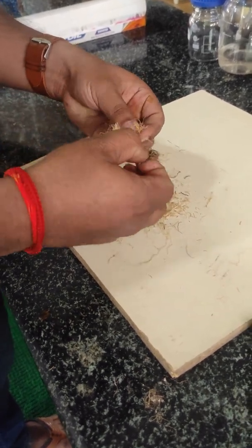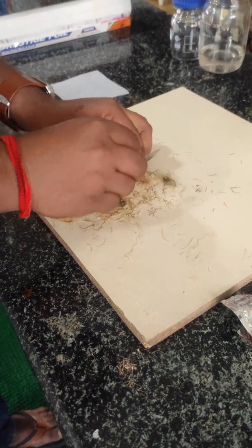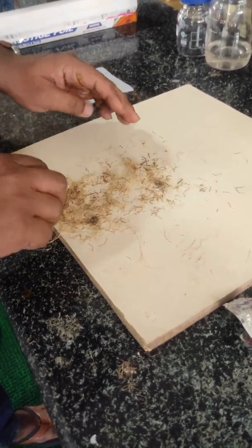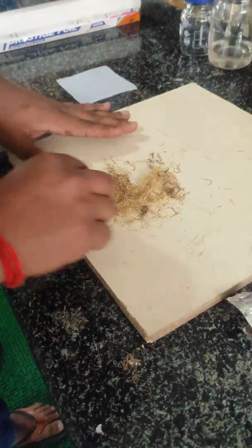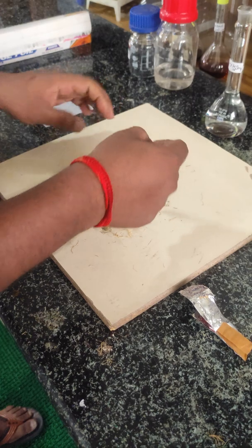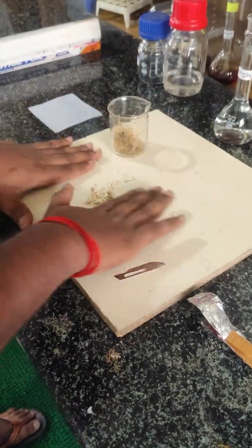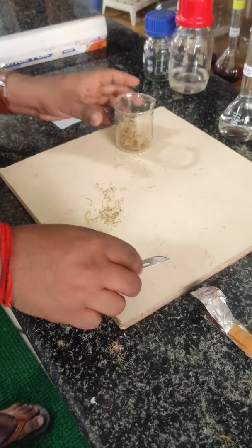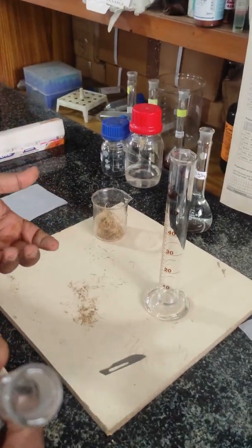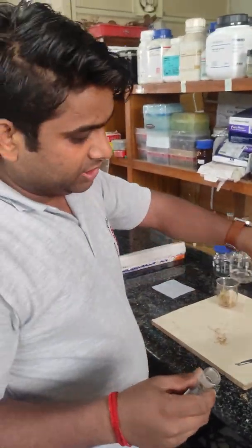You can also use scissors to cut the thallus. Now transfer the thallus into a beaker. Now we are going to use 5% NaOH. We generally use 20 ml of 5% NaOH for 1 gram of material.